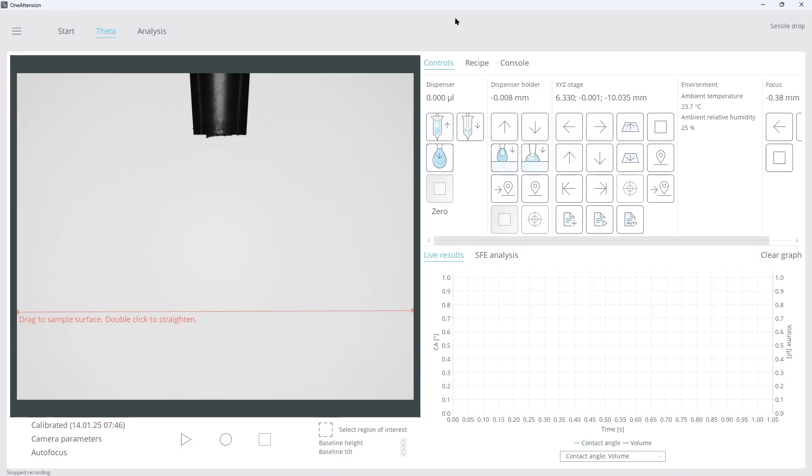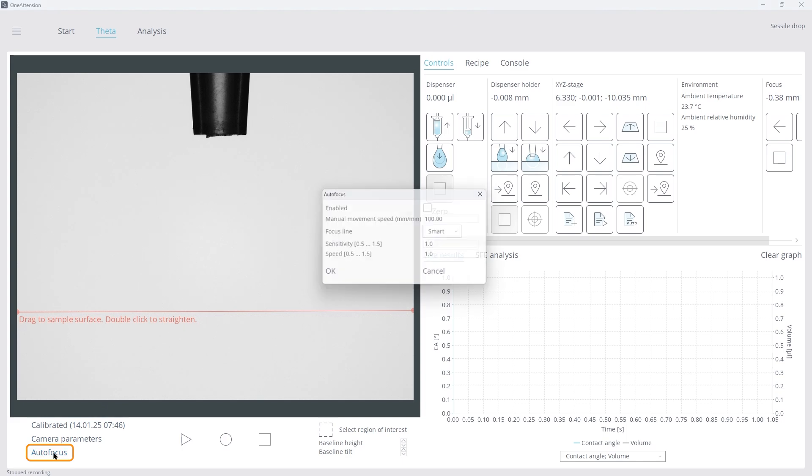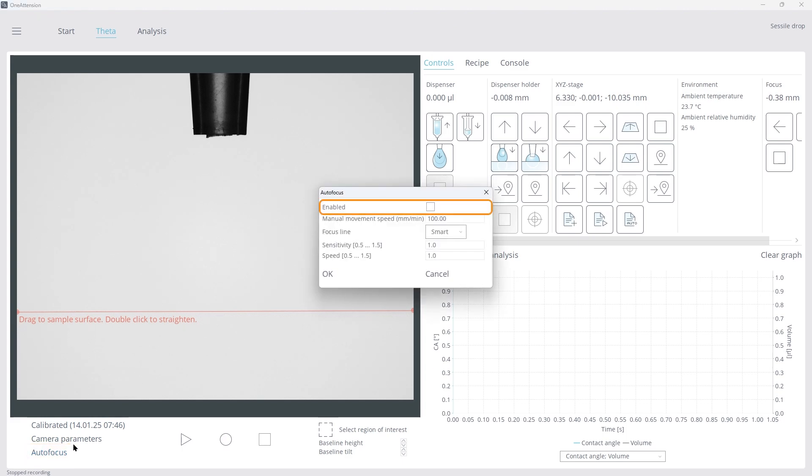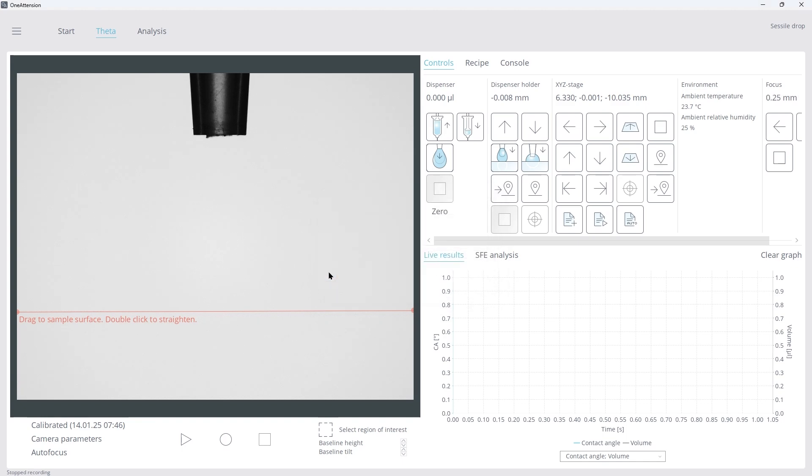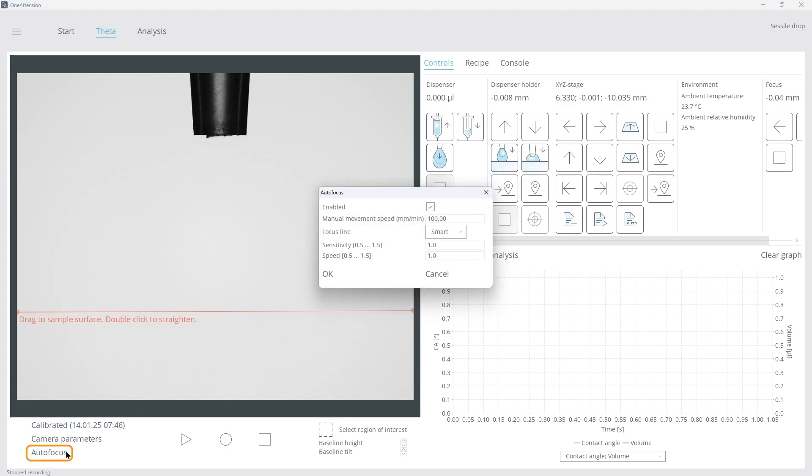After the initialization process, I'll prepare the camera. First, to bring the pipette tip into focus, click Autofocus, then Enabled, then click OK. After the tip is in focus, disable the Autofocus, and click OK.